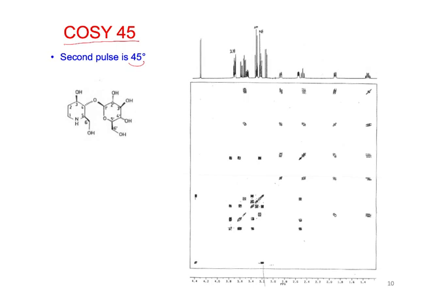For one thing, this is going to be less sensitive because we're not actually tipping all of the magnetization into the XY plane.